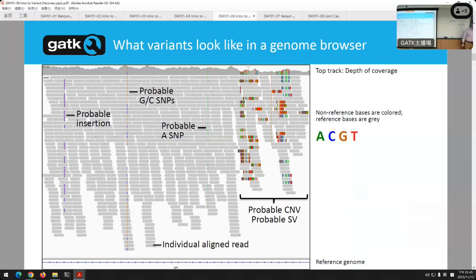And so when Emma talks about structural variation, she'll show you how they use that signal to detect much larger events. Remember, these reads are very small. The structural mutations are very big, maybe thousands or tens of thousands of bases long. You're trying to discover them from these little pieces of DNA. And so this is the kind of signal we use to find those bigger things.